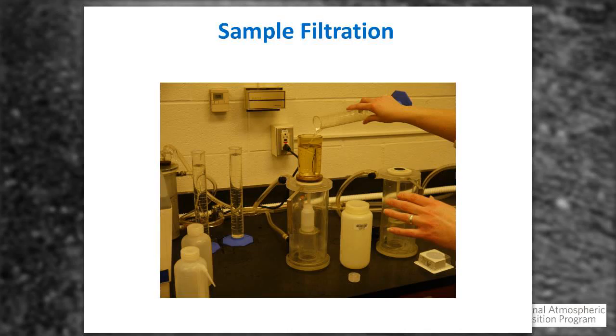Just a note, there's a lot of special projects that go on with your samples. You may think it's just the acid rain and the nutrient studies, but we've looked at fallout from the Fukushima nuclear disaster. I think we're coming off to the fourth year after that. It was 2011. And a number of special studies utilize your sample.